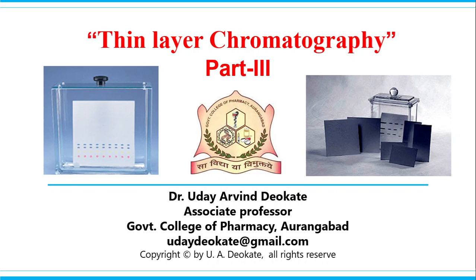In part 2, we have studied the steps and operation of thin layer chromatography, in which we have studied choice of adsorbent, the various adsorbents used in thin layer chromatography, their classification and various examples. Then preparation of plate, the various techniques to coat the plate for chromatographic purpose. Then preparation and application of sample on the plate. And the last part we were discussing, that is choice of the solvent, that is mobile phase.